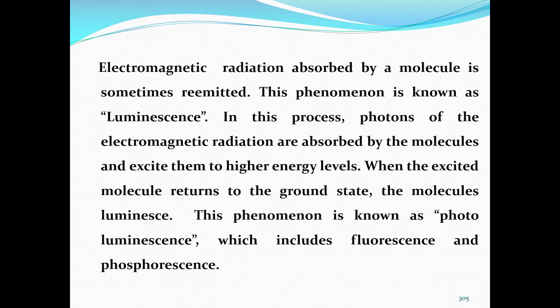All these things will be taking place, and one of them is fluorescence. In fluorescence, electromagnetic radiation absorbed by a molecule in a given solution is sometimes re-emitted. This is known as luminescence.